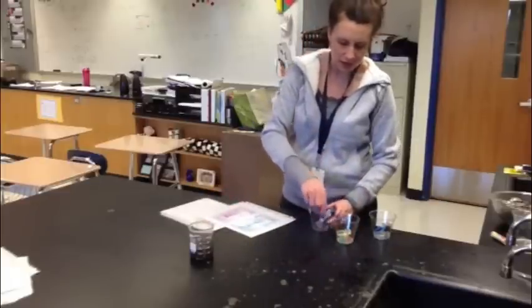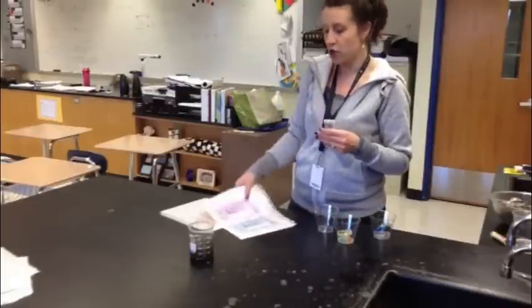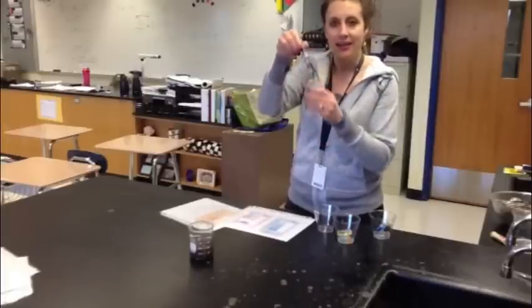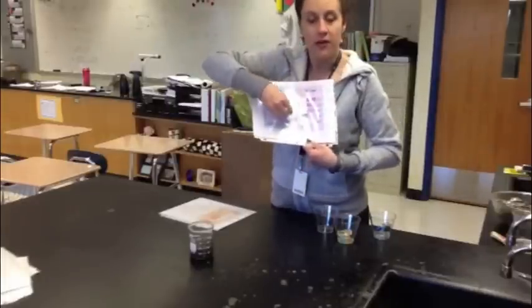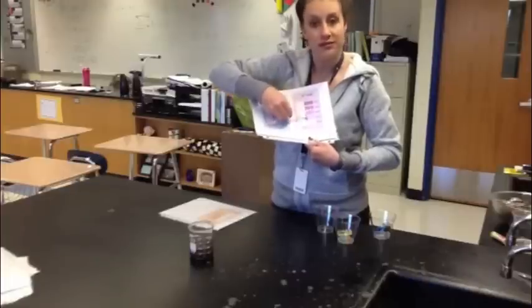What you're basically going to do is just look at the cup, take the little test tube out of the cup, and compare it to the color charts that are sitting at the station. You'll find one that says a little N on it — that's the nitrogen test. Compare it to the colors of the nitrogen on the color chart at the station.